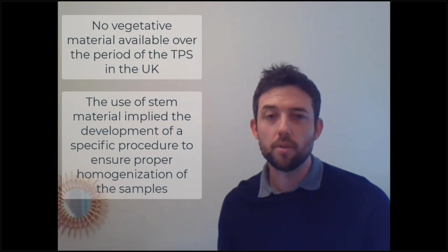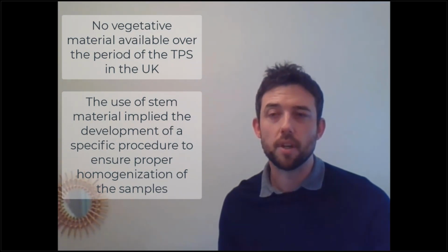The method we found most effective was to cut the stem material up using secateurs and place these small pieces into large Nalgene bottles containing large ball bearings with a small amount of buffer.